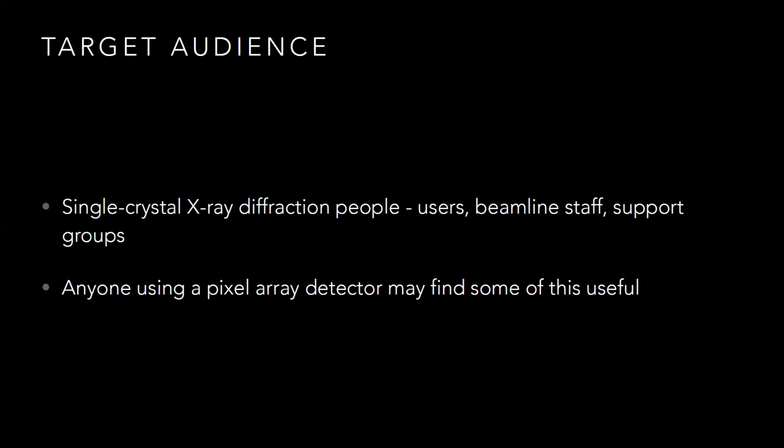Okay, so this is of interest to people who work in single crystal X-ray diffraction. I will not be offended if you have a 20-minute nap if you are not interested in single crystal X-ray diffraction. However, if you are interested in pixel array detectors and you have to look after them and curate them and look for dead pixels, I will occasionally mention things that may be useful to you. So keep half an ear.